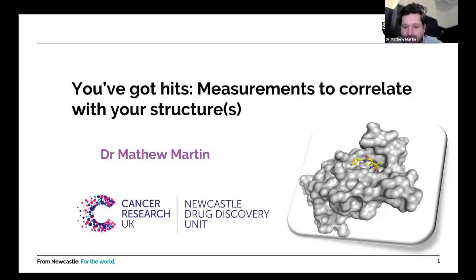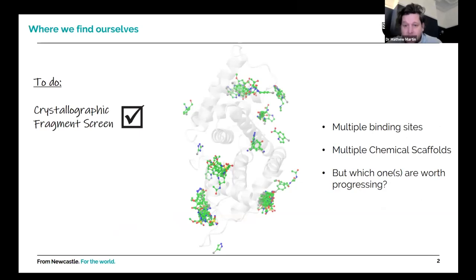I work at the CI Drug Discovery Unit, and today I'm going to talk to you about life after your crystallographic screen and touch on some of the thought processes that we go through here to give us the best chance of developing the fragment hits. So basically we're going to jump in here.